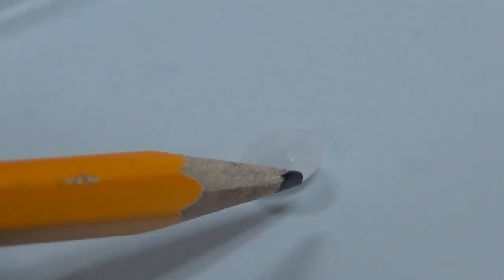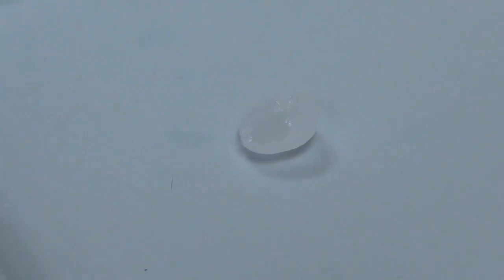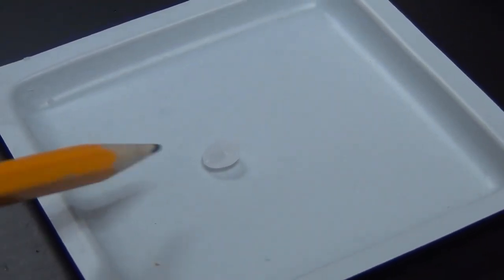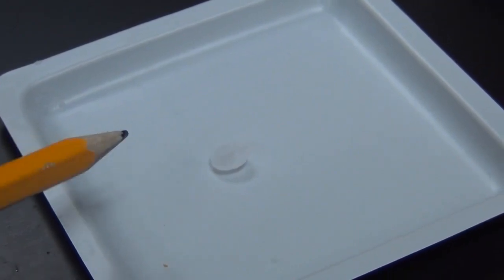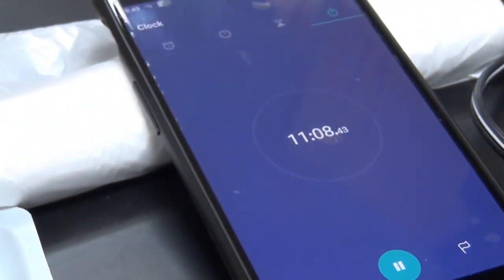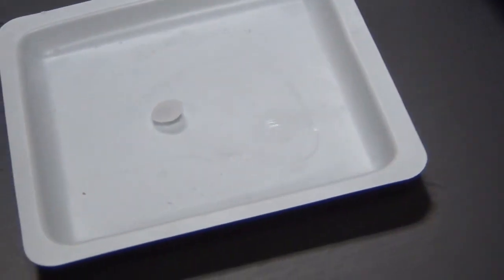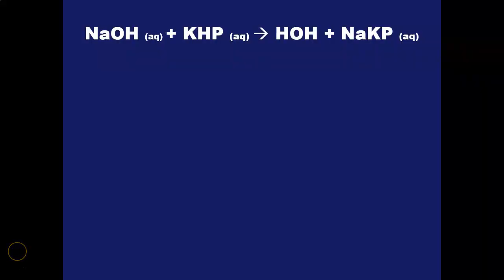The pellet is starting to get shiny because it has absorbed so much water vapor from the air that it's actually forming a tiny puddle of saturated sodium hydroxide solution. As it sits on the counter, it is gaining mass from the water it absorbs. In just 10 minutes it has gained enough mass to measure with a milligram balance. This shows why it's very difficult to get an accurate molarity for sodium hydroxide made from the solid.